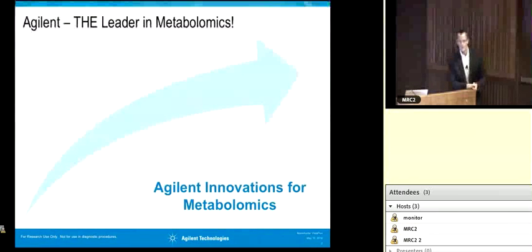So there's three things to really keep in mind here. It needs to be a high mass accuracy and high resolution instrument, obviously, because you need to have good mass accuracy and accurately measure the isotopologs. But if you guys think about this, we're going to be measuring isotopologs. What do you think the single most important or perhaps single most sensitive parameter is that a mass spectrometer needs to have in order to do this well? It's on the slide if you need help. Second one on the list.